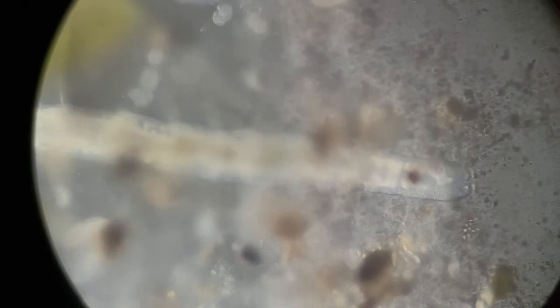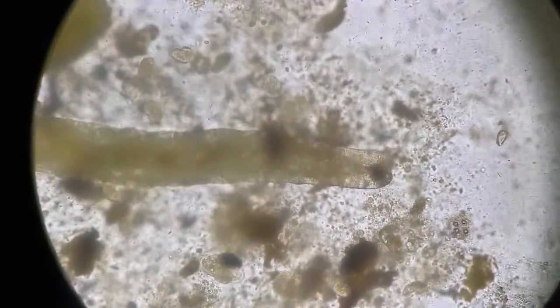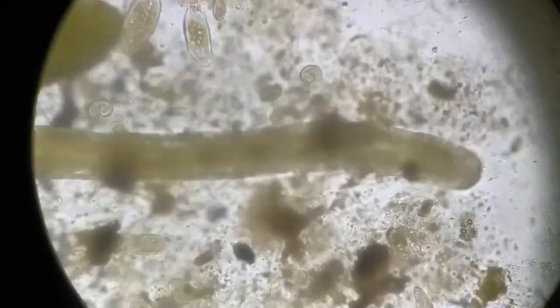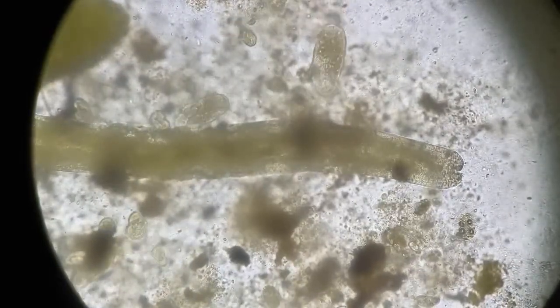Now, just for the sake of comparison, I'll go back to the other light source, that is the microscope's light source. 1, 2, 3. This is what you see in the normal microscopic view, the microscope's light view, and it's all dark.